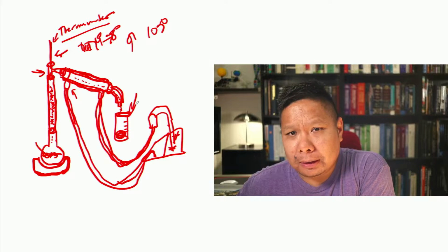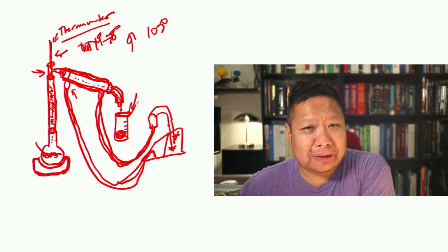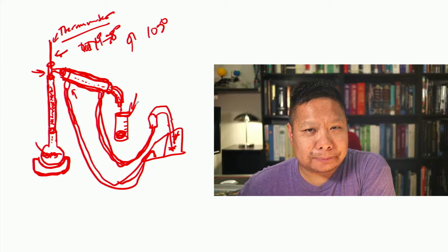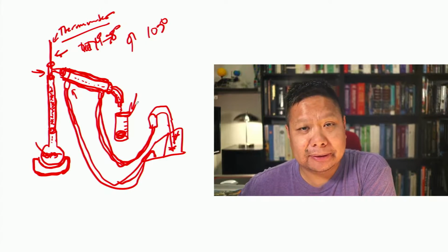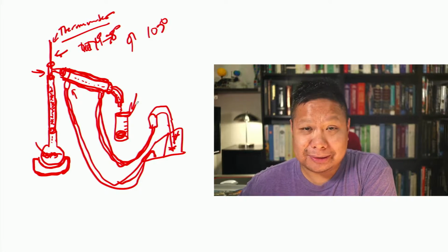But this azeotrope, what it means is that you can never get water 100% out of the ethanol, and so you won't ever have pure drinking ethanol that's 100% ethanol, also known as 200 proof. It's always 95% or 190 proof, right? Specifically, the azeotrope of water and ethanol when you're doing distillation is 95%, because you can get up to 95% pure ethanol. The rest of it will be water because of that. That's this thing called the azeotrope.